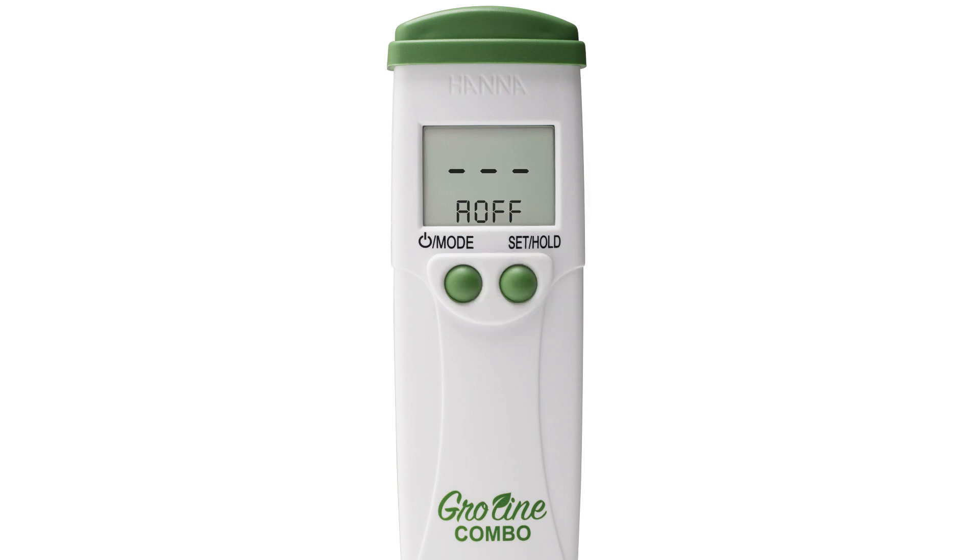Again, press the mode button once you have your preferred setting to return to measurement mode. Once all your settings have been set to your preference, the tester is now ready to be calibrated. Calibration is an important part of keeping your tester operating at its best — we recommend calibrating before each use. You can find everything for your tester at hannahins.com/HI98131.